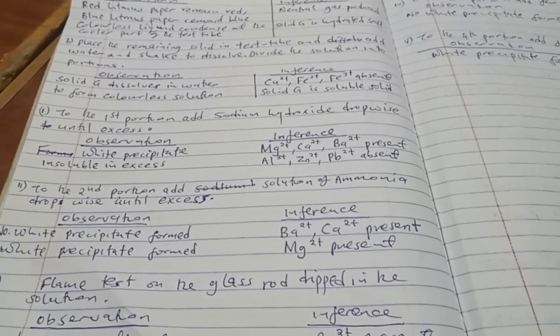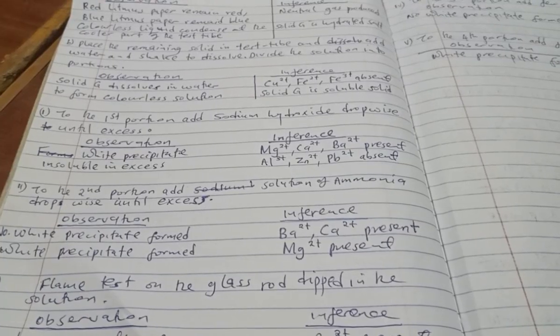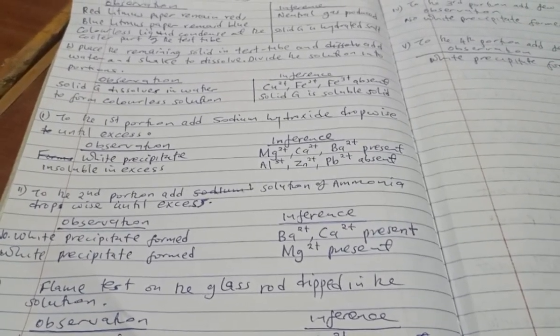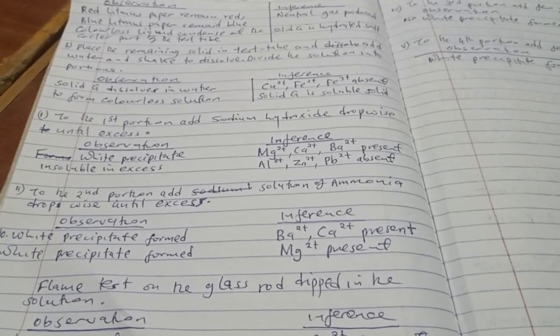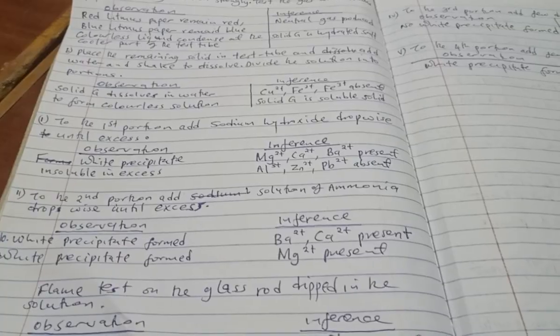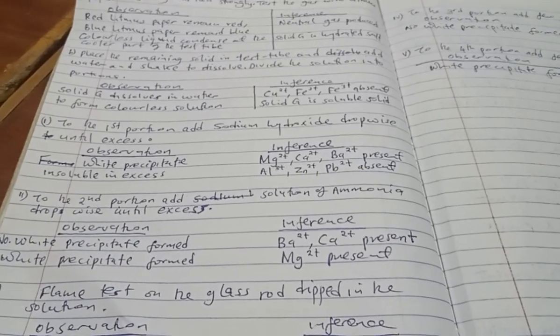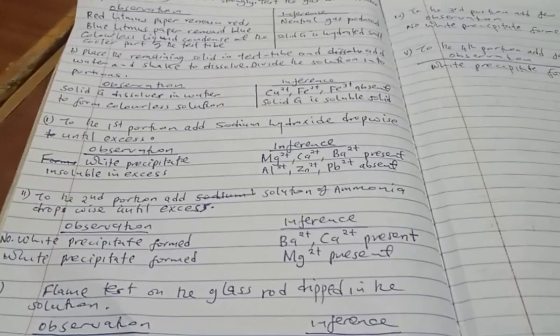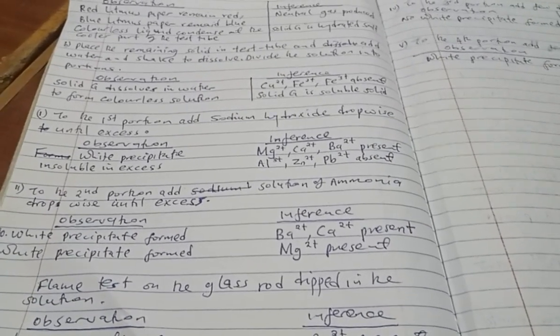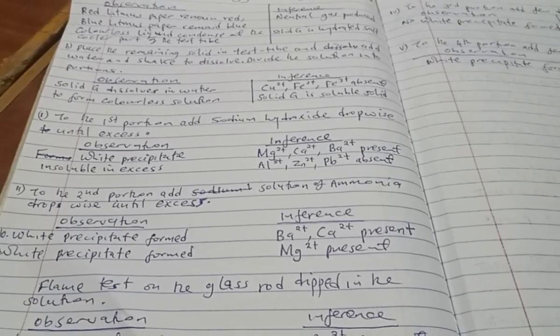But if you see a white precipitate with ammonia, then we can easily say magnesium present. Remember, if there is a white precipitate with ammonia, aluminium and lead also normally form a white precipitate insoluble, but you had already eliminated them, so you don't write them down here. Then we may say that barium and calcium are present.